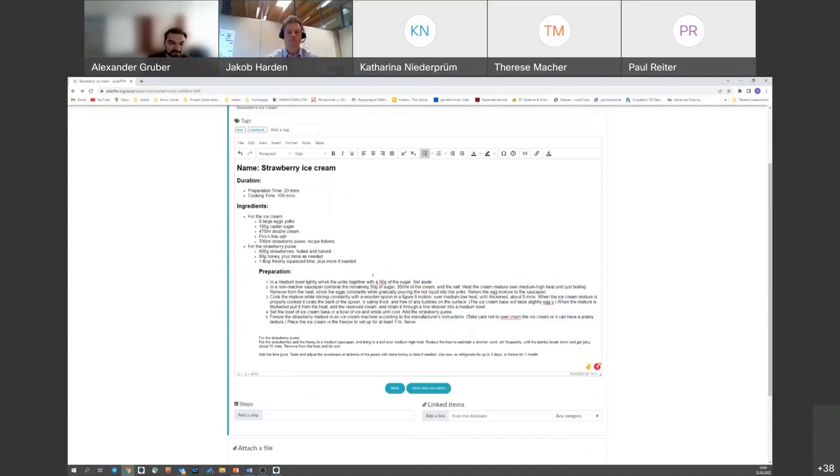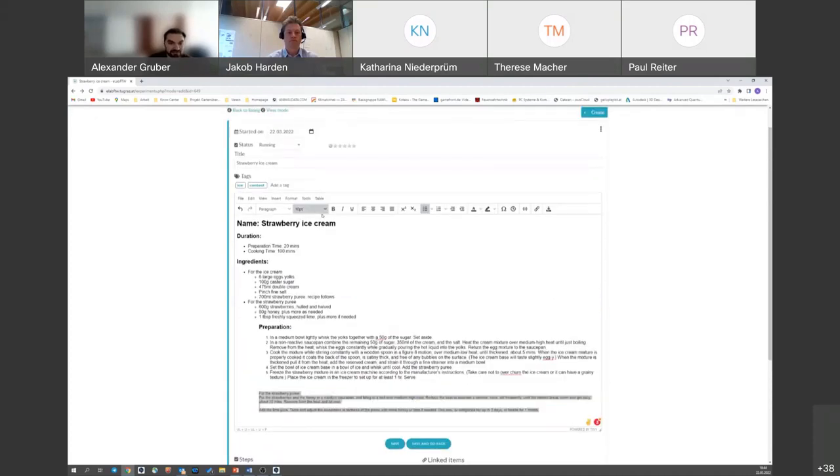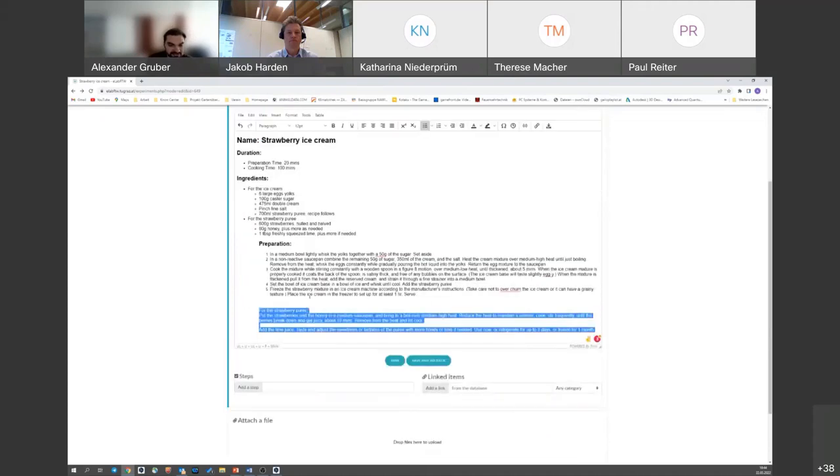So you can see that some of the settings you already made in another file. Maybe you already have documentation somewhere in another file, like a Word document or an editor, which will be partly taken over into this ELAB FTW file, which comes pretty handy. It doesn't work in every situation, but for most of our stuff here. You can also use it if you want to have a table here or other stuff. Okay, so that's nice.